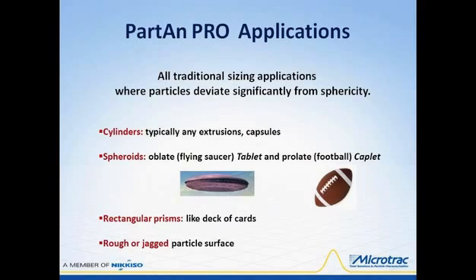Here the 3 major axes have 3 different dimensions, which are all measured and reported, and from which all the shape factors are calculated. And the volume of each particle is calculated as the product of length, width, and thickness, which provides a much more accurate volume distribution than the equivalent spherical diameter as reported by 2D image analysis, and overall more accurate size and shape data.